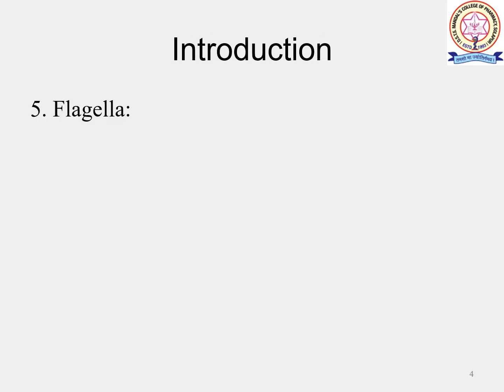Next is the spores and flagella. The organism may be without flagella, that is atrichate, or monotrichate, amphitrichate or peritrichate. These flagella cannot be identified with a plain microscope.